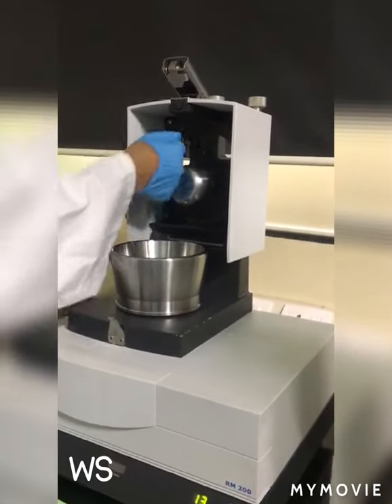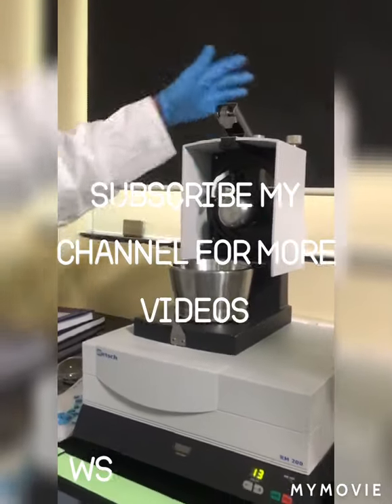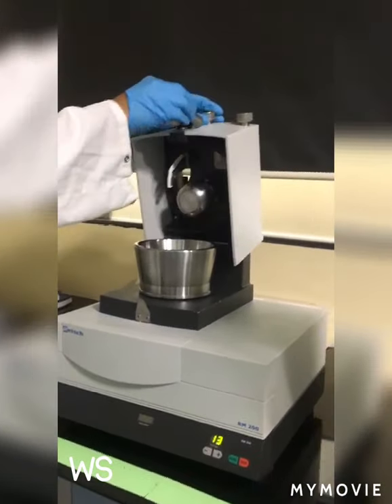This is a scrapper made of PTFE. If you want to remove it, you can remove it. It is good for wet grinding. For dry grinding, I don't think it is required.